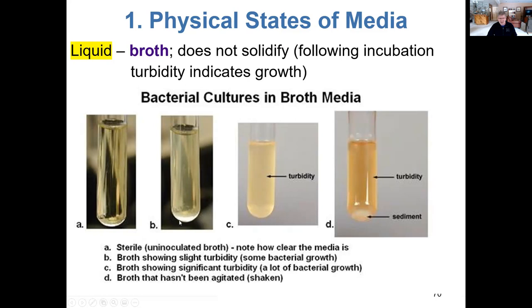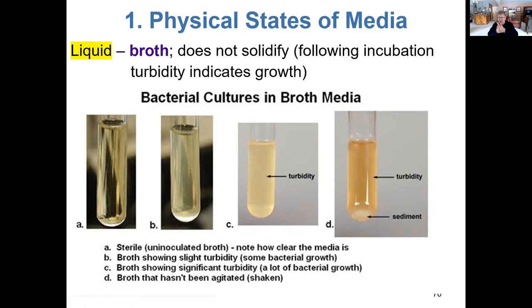This tube is showing slight turbidity — you can't read through it very well. Here's obviously some great turbidity, indicating a lot of growth. One thing we have to be cognizant of is that if tubes are left to sit long enough, sometimes they can develop sediment in the bottom. So when we want to inoculate from it, we would have to mix that solution to agitate the sediment and get the cells distributed throughout the liquid column.